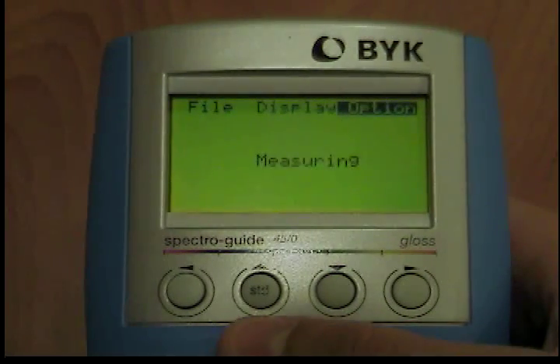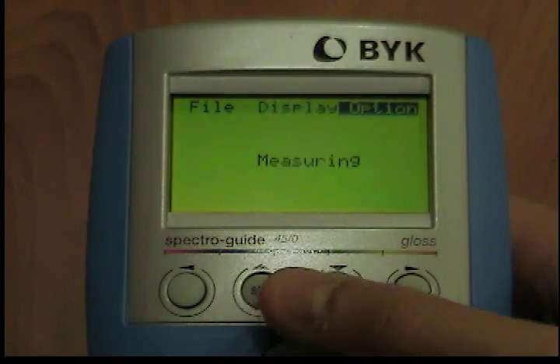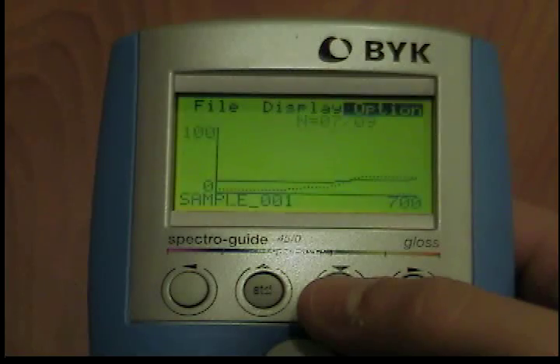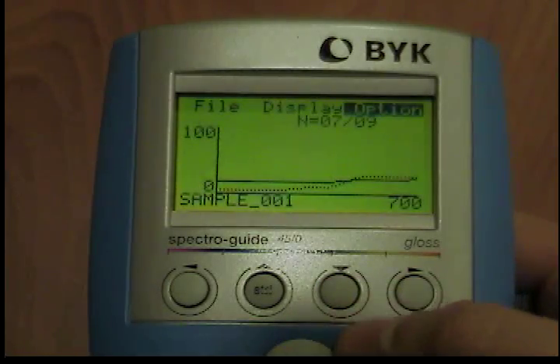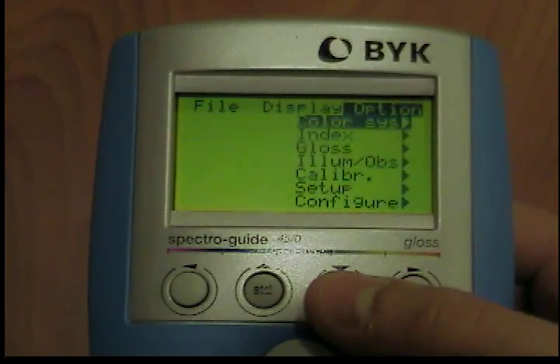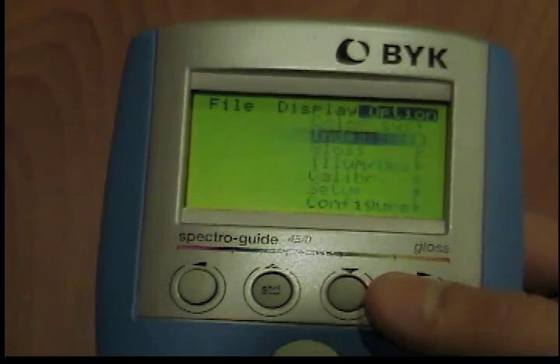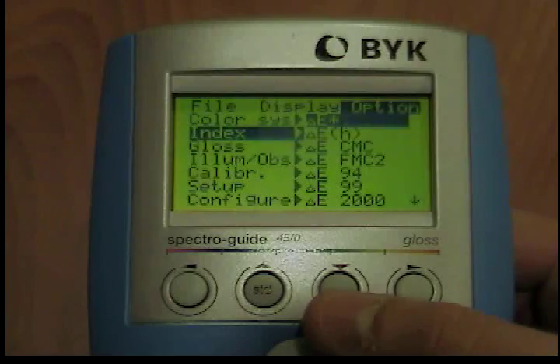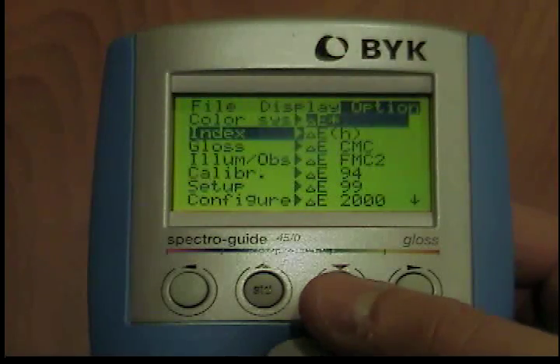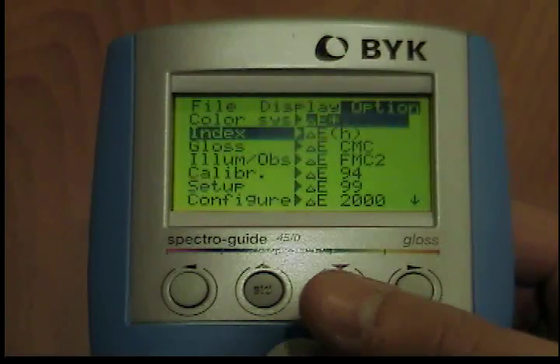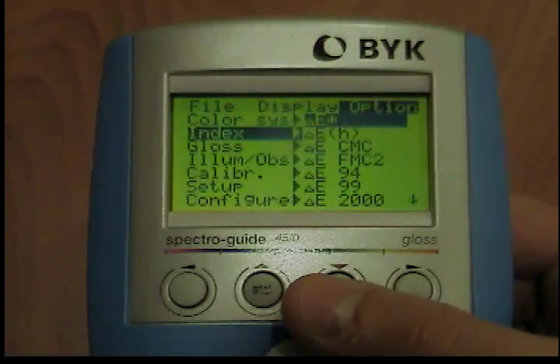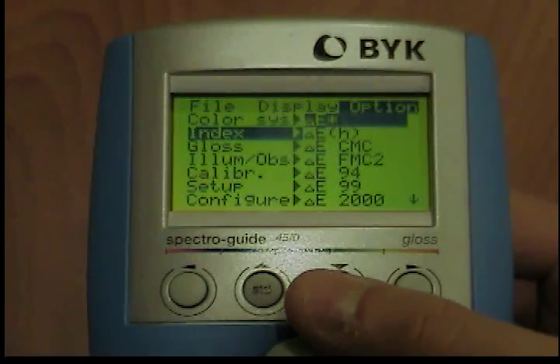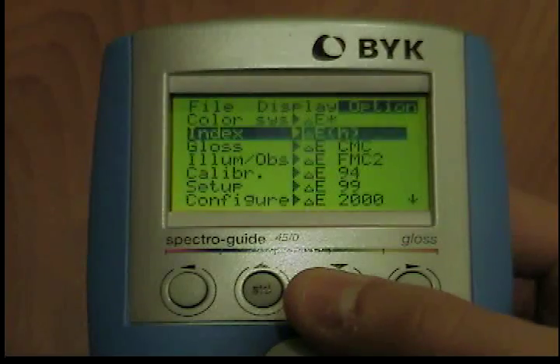Index. From the options menu, use the down button to move the cursor to the index option. The submenu will open when you press the operate button. Move through the menu with the up and down buttons and confirm the required index with the operate button.